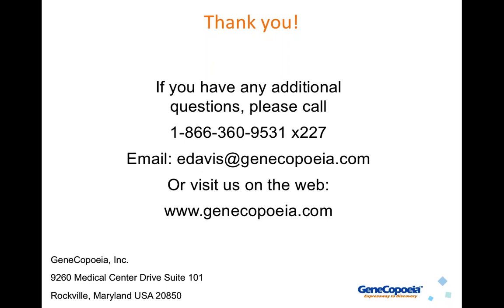What about in-frame deletions? One in three times NHEJ should cause in-frame deletions, multiples of 3, and therefore only delete a few amino acids rather than cause a frame shift or nonsense mutation. Is this something that we need to screen for later? Yes, absolutely. That is a very good question.